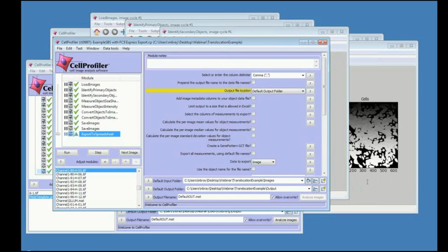And hi, this is Sean Burke. We did have two questions from Frederick Henry regarding CellProfiler that maybe you could address, Mark, real quickly. Okay. The first was, can the Align module be used with images taken as part of a time series to correct for slight drift?